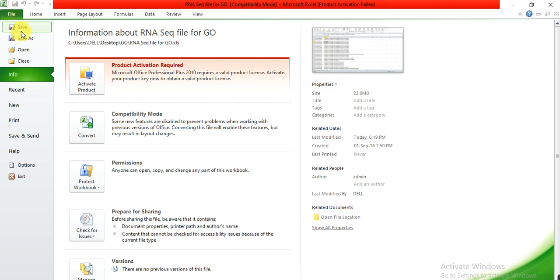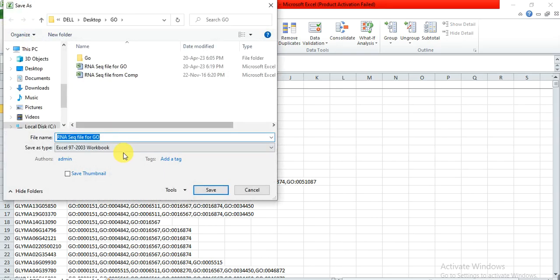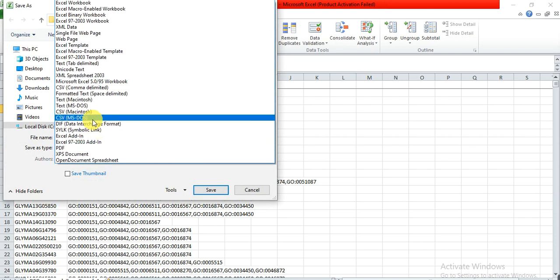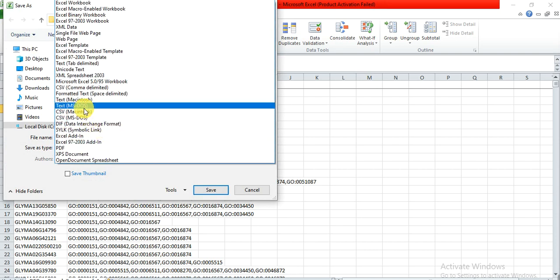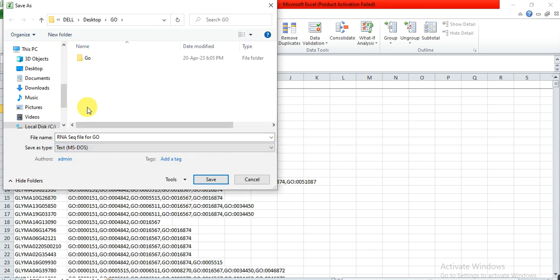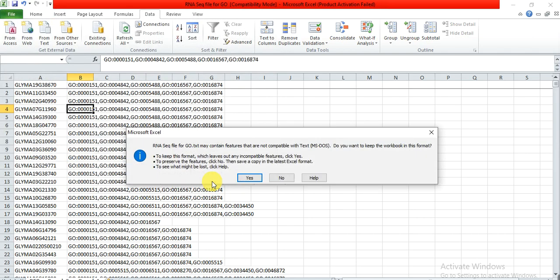Now save the file as a TXT file. Go to File, Save As, and from here select Text (MS-DOS) format, then save it.